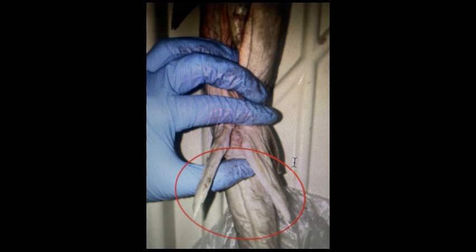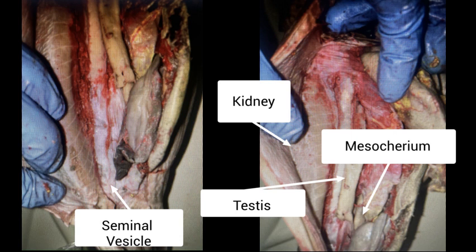This picture shows our specimen in lab. Based on the characteristic I just mentioned, the claspers, it's obvious that we have a male dogfish shark. Thus, we will focus on male parts more. In the male shark, the reproductive system is easier and much simpler than the one in females.